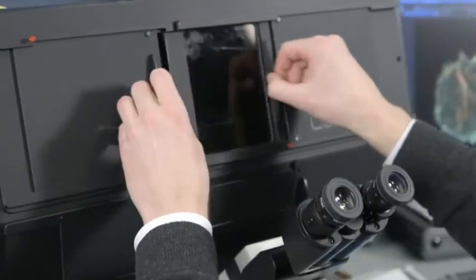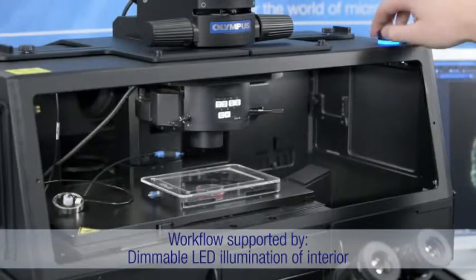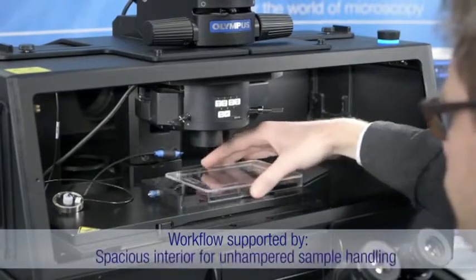With the workflow-oriented Cell Vivo, samples are easily accessed with a removable cover or viewed with a dimmable LED, allowing for effortless sample handling within the spacious interior.